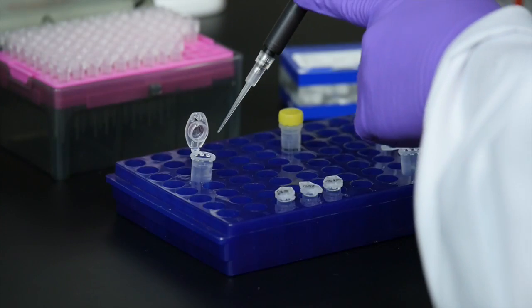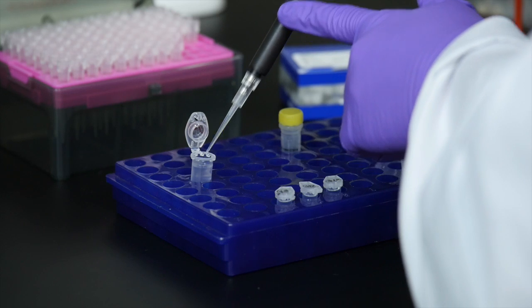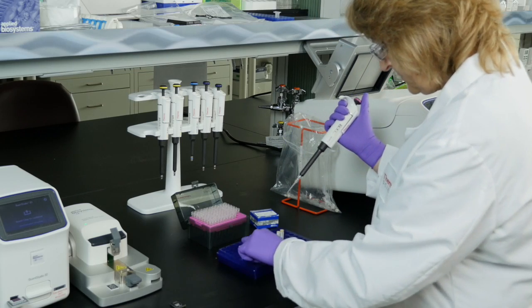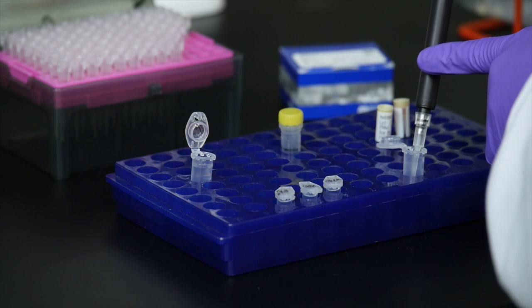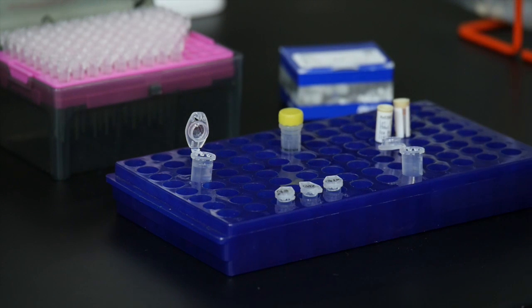Your reaction mixture is made just like a real-time PCR reaction, mixing your TaqMan assay, your DNA or cDNA sample, and the master mix in one tube.